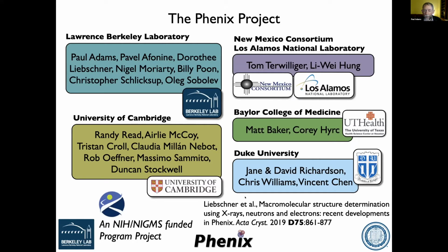And just a quick reminder, if you've not seen it, there was a new paper we published last year which talked about all the recent developments in Phenix for crystallography and cryo-EM. And so if you use Phenix, you should cite that paper.